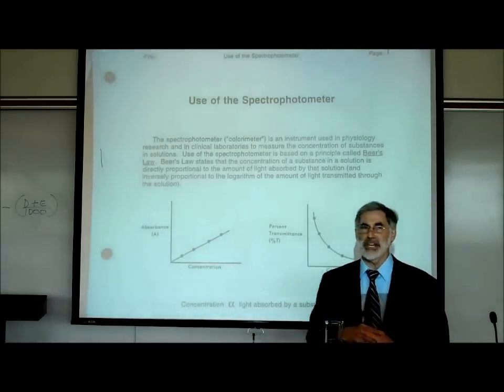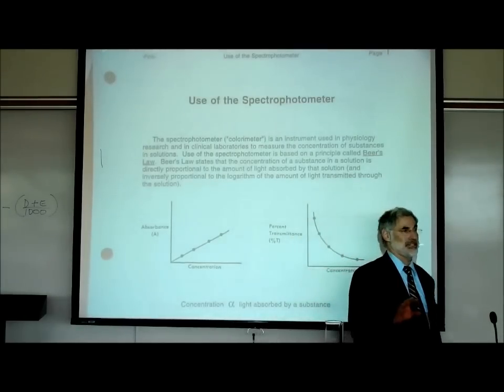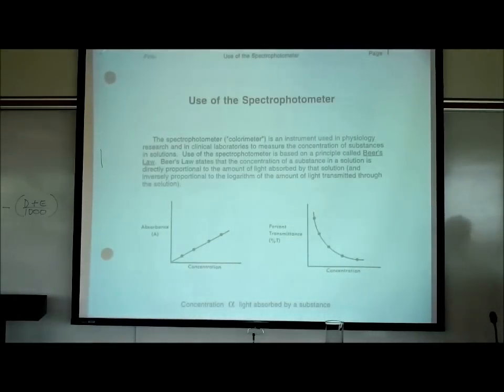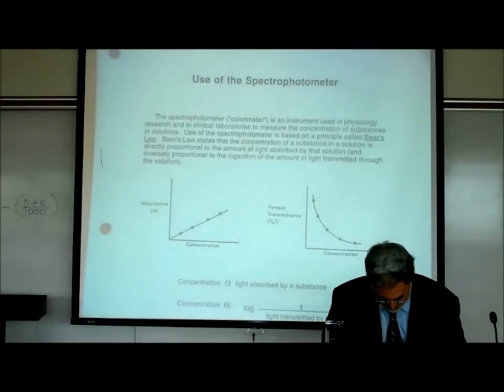And next class meeting on Wednesday, I'm going to give you an exercise to do where you're going to be doing some graphs. All that will be included on the first lab test. But let's cover the theory behind it. The spectrophotometer.